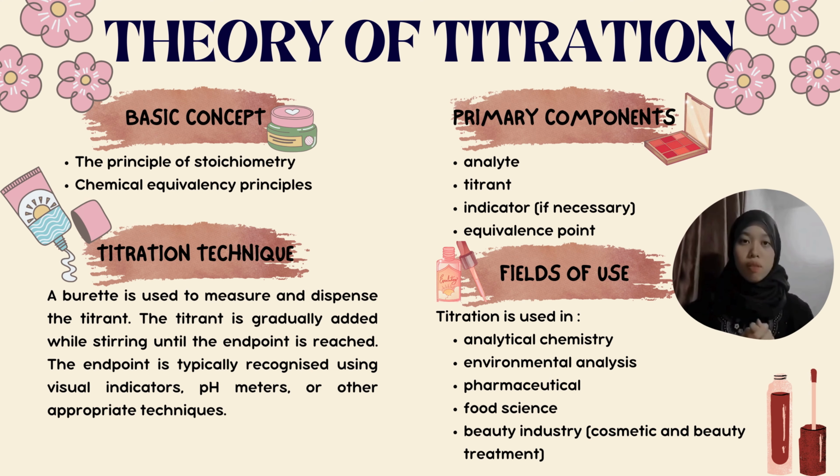Next, we will learn theory of titration. What is it? Theory of titration is about basic concept, titration technique, primary components, and field of usage. I will explain one by one. Let's start with basic concept, which is the principle of stoichiometry and chemical equivalency principle.